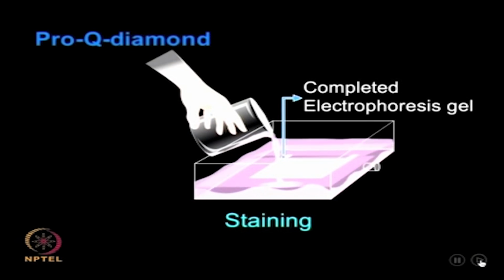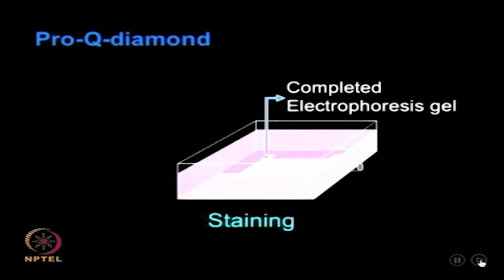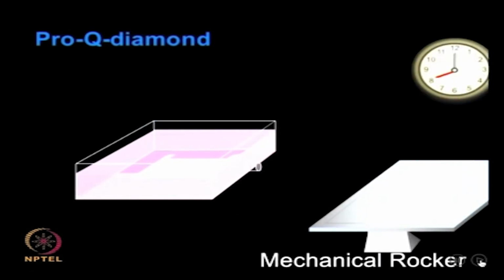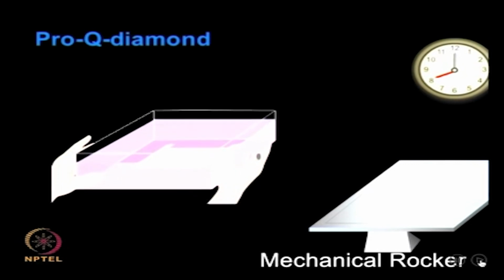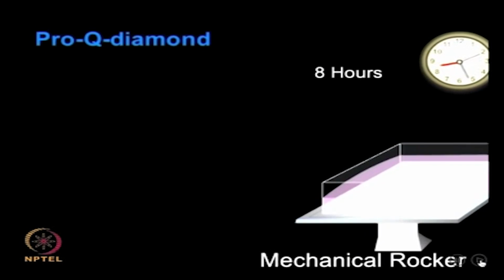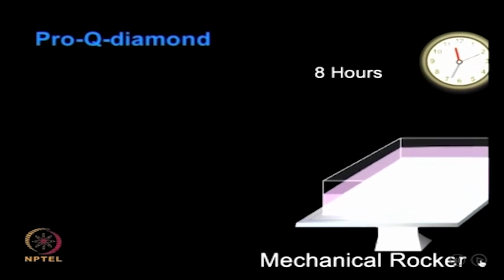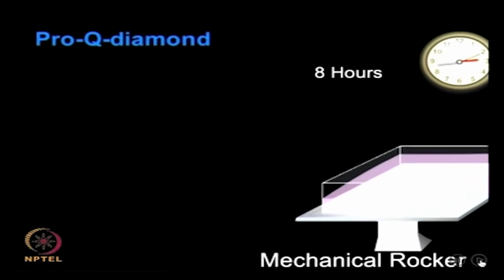The staining procedure is similar to the Sypro Ruby red, which was described earlier. This fluorescent dye offers sensitivity down to the nanogram level and detects specifically the phosphorylation taking place at serine, threonine or tyrosine residues.